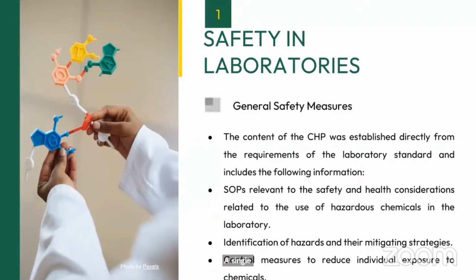Now, for this I have a very good example. Considering the formalin in your histopathology, we have seen the grossing area is a closed cabin where the grossing is done with running formalin. Now, the exposure to each individual should be restricted. So, not only one person should be put continuously on these grossing duties. The duties should be rotated, there should be appropriate rotation of the staff personnel working in this grossing area so that the exposure will be limited or reduced for each individual.